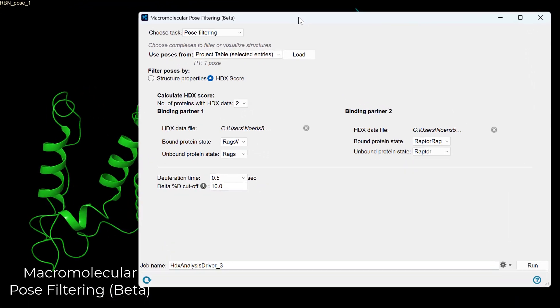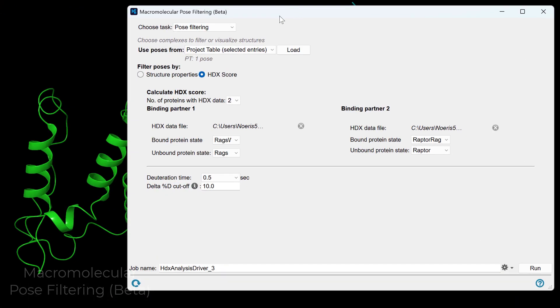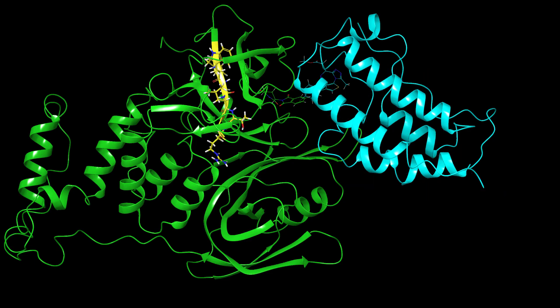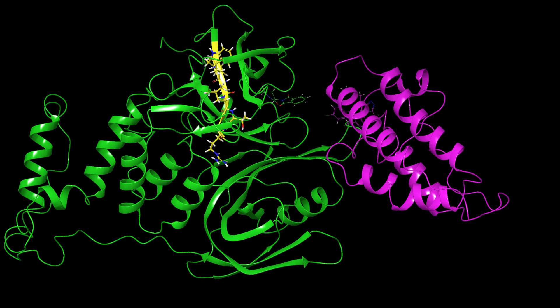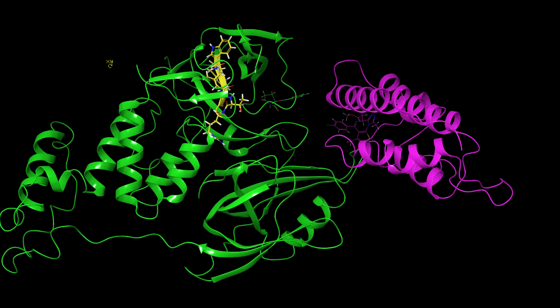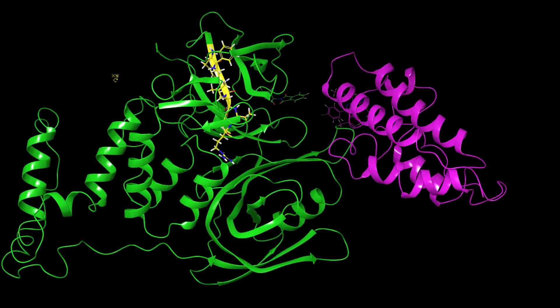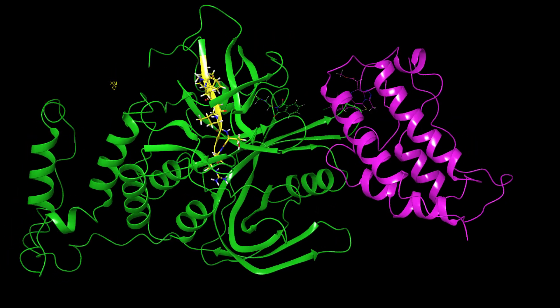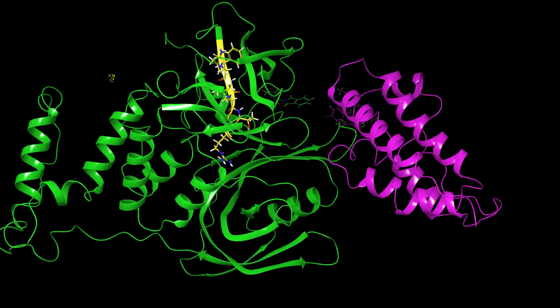Also in open beta is the macromolecular pose filtering panel. Improve the reliability of your protein-protein docking studies by using experimental hydrogen-deuterium exchange mass spec data to filter docking ensembles and enrich near-native binding poses even when data is sparse.